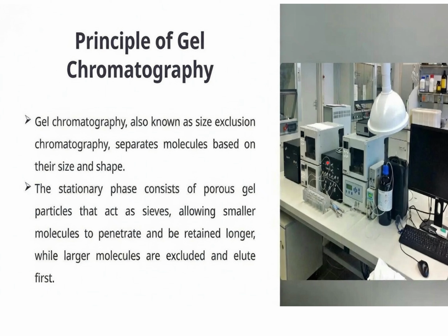So you can see here the instrumentation of GFC. Here is the mobile phase or the buffer media. This is the recorder. Here samples are applied. This is the sample preparation tray, and this is the recorder. So these are the overall instrumentation for GFC.